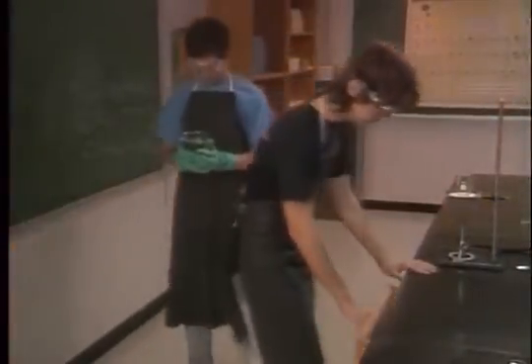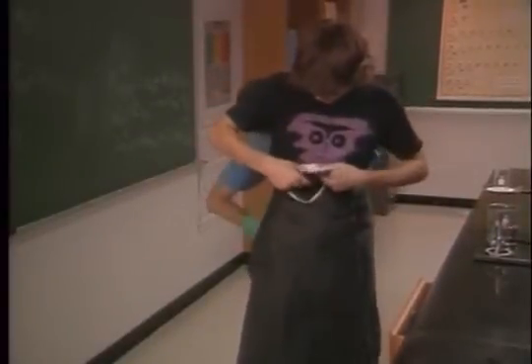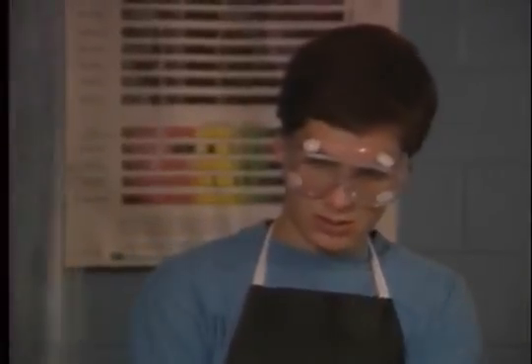Non-corrosive chemical splashes on bare skin should be rinsed off in the lab sink with plenty of water. Spills of corrosive materials require a lot more water. Don't wait till you feel pain from the chemical. Head for the safety shower immediately. Rinse your body thoroughly as fast as possible. Take off all your clothes. Don't let modesty make your injury worse. Your teacher will clear the other students out of the room. Stay under the shower for at least 15 minutes.